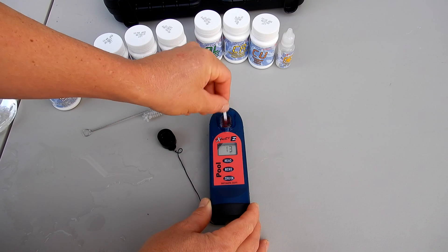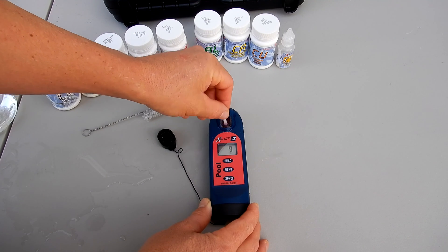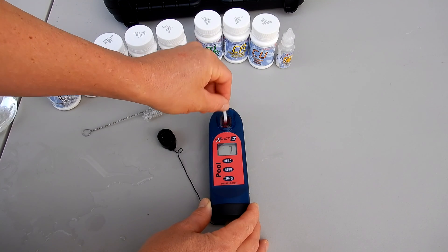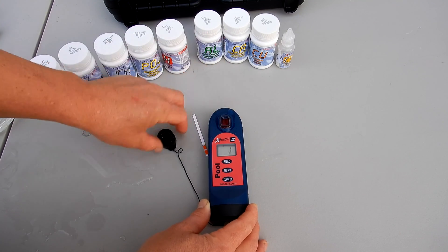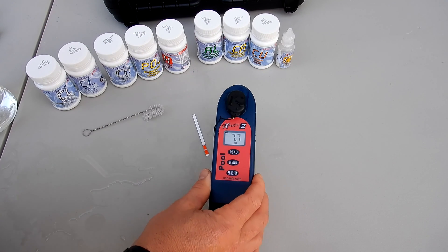You would follow the same procedure with all the testing except for the cyanuric acid, which uses a liquid reagent. Once the meter reaches zero in the countdown, it will display the reading of the test factor. You can see here that the pH is at 7.7.